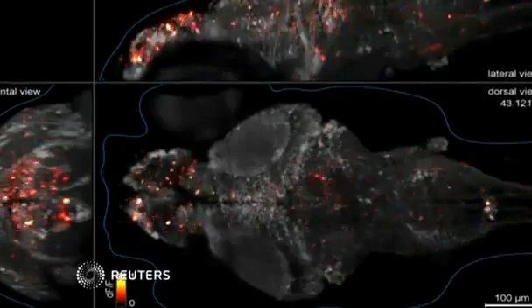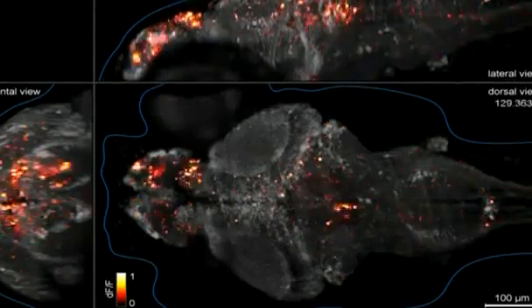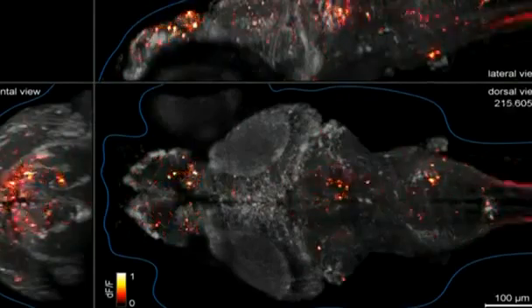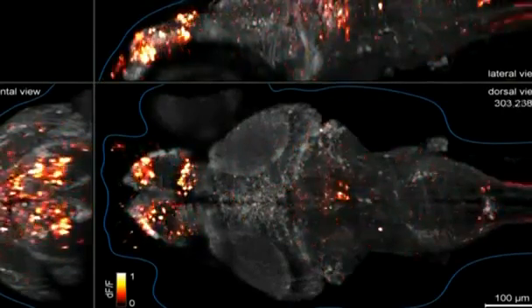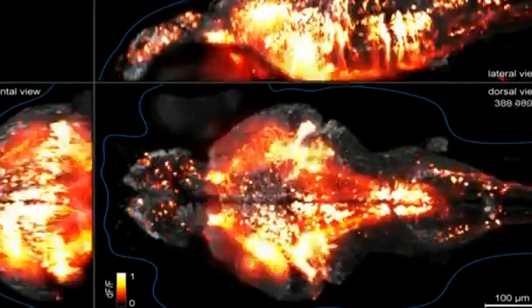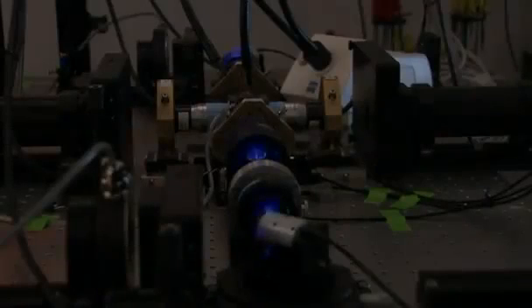When a zebrafish senses the presence of food or a new sight or smell, its brain fires into action. The neurons in this fish have been engineered with a fluorescent gene that triggers small explosions of light whenever calcium ions produced by thoughts are activated inside the brain cell. And as the fish thinks, a state-of-the-art microscope developed by scientists at the Howard Hughes Medical Institute sends pulses of laser light through its brain.